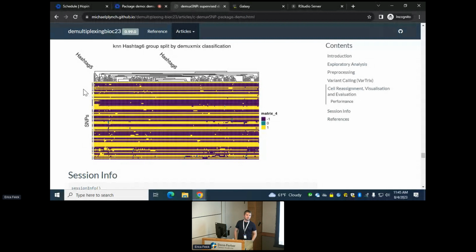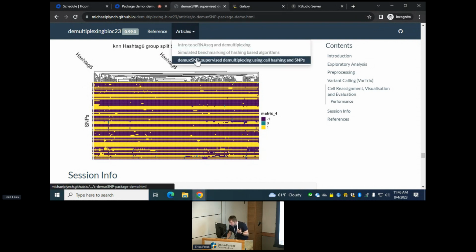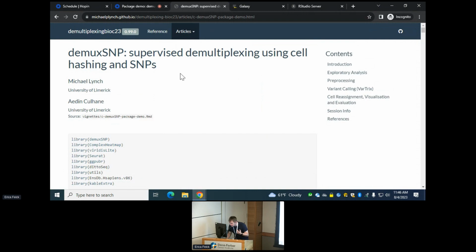I have a question: do you find that in practice, the demultiplexing quality is related to the scRNA-seq data quality? It may be, but not necessarily in every case. It's not something we've formally tested, but if I was to speculate, if I can bring up another plot here.